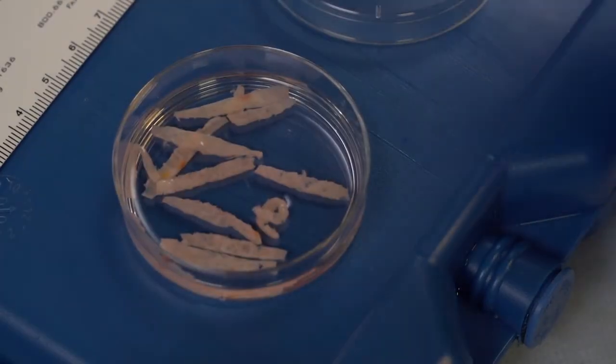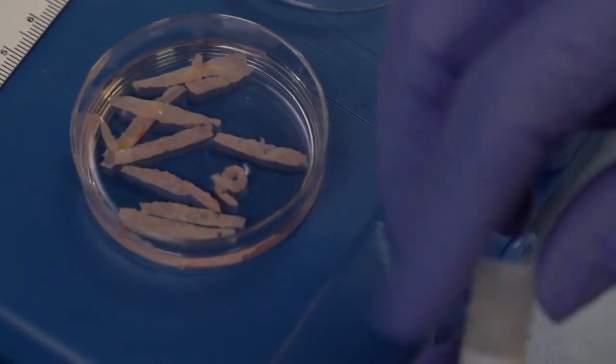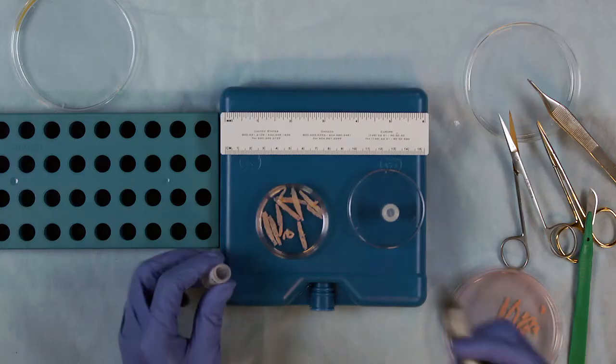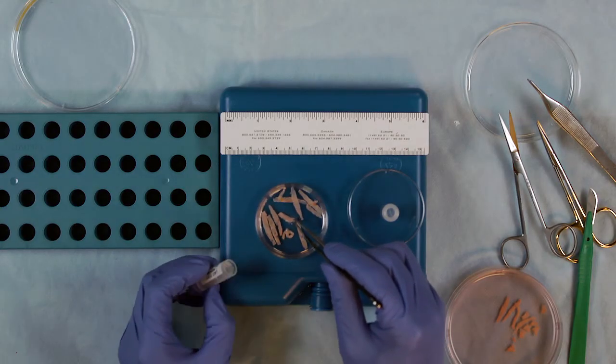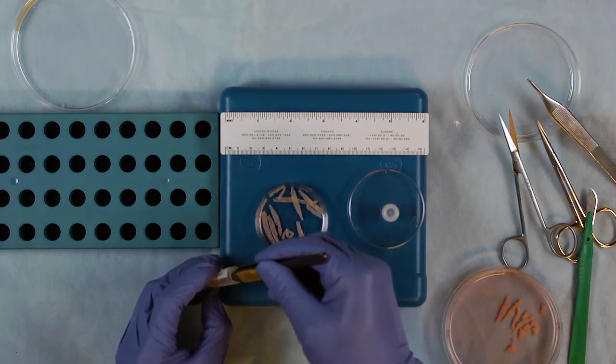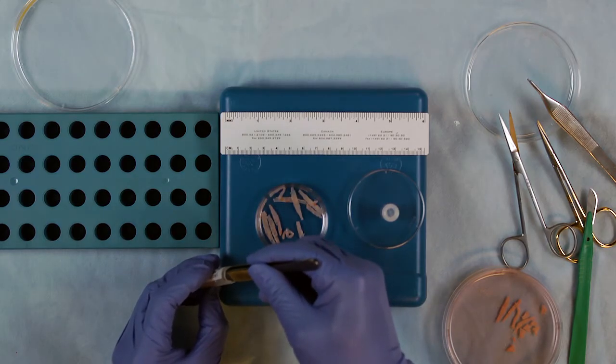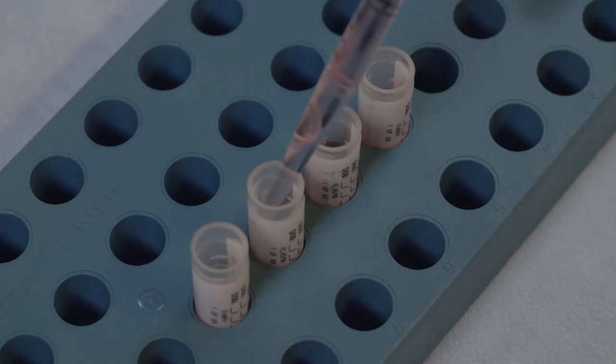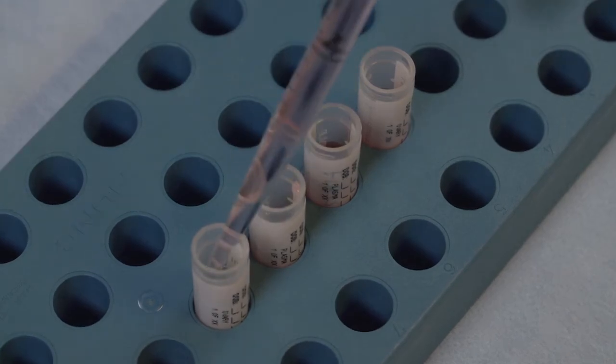Load the tissue into the vials preloaded with 0.8 milliliters of cryomedia, approximately one to two pieces per vial following the protocol that's described in the NPC manual. Then add more cryomedia so that the final volume is up to 1.5 milliliters.